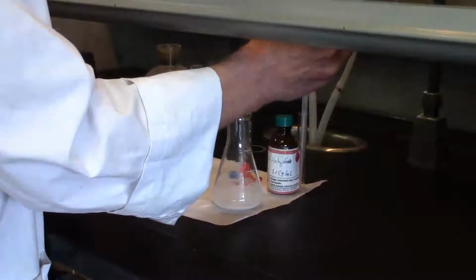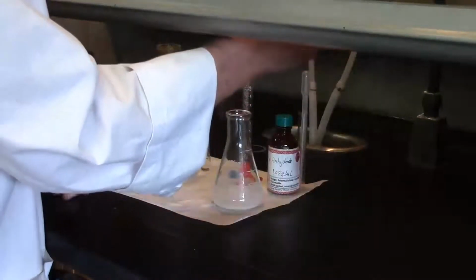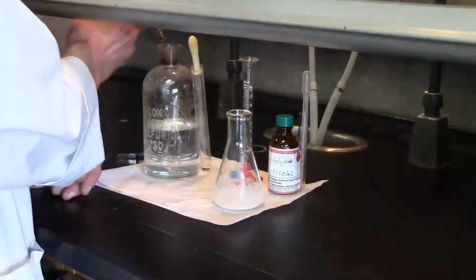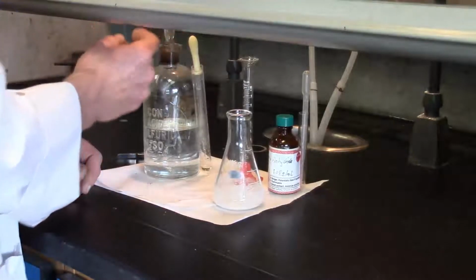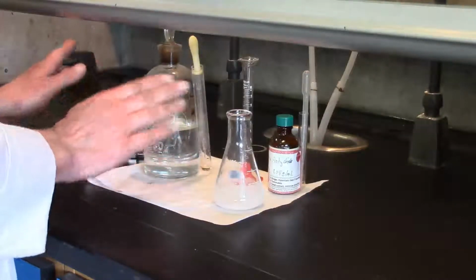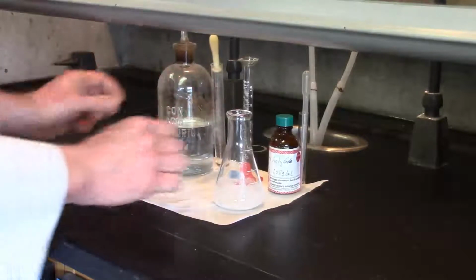So I'm going to count here. 1, 2, 5 drops. I will pour the rest back into the original container and of course close the lid. Please do not leave the sulfuric acid lid anywhere around here. It's very corrosive. It will corrode the paper here. You don't want anyone touching it. Okay, so please use that sort of technique.